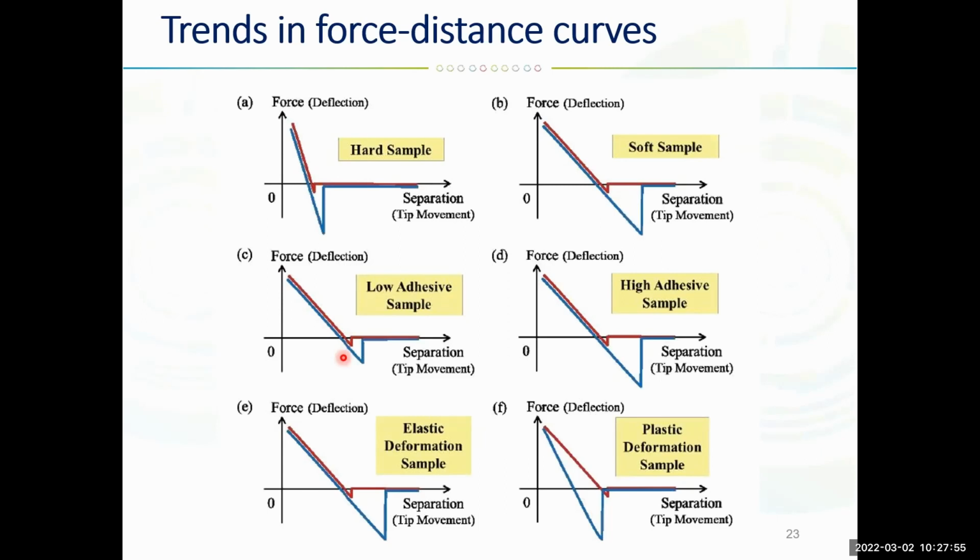Depending on the properties of the cantilever and sample, the tip can cause elastic, which means reversible, or plastic, or irreversible, deformation of the sample. So here you have elastic and plastic deformations. If the sample is compressed excessively by a hard cantilever, the sample surface will deform irreversibly. That's why it is important to understand the properties of your tip and the cantilever.